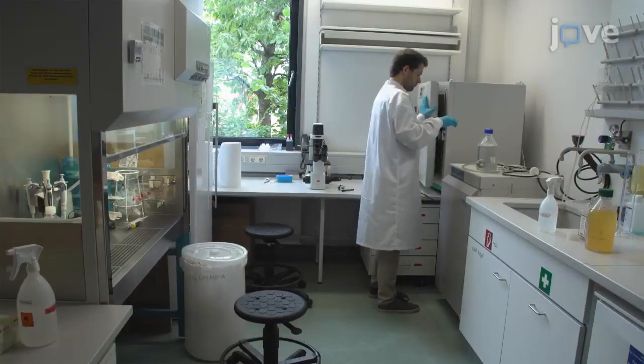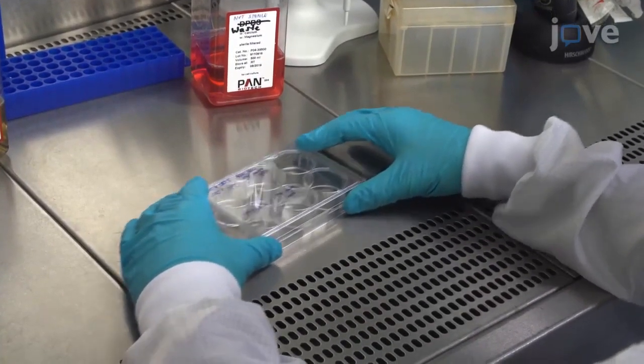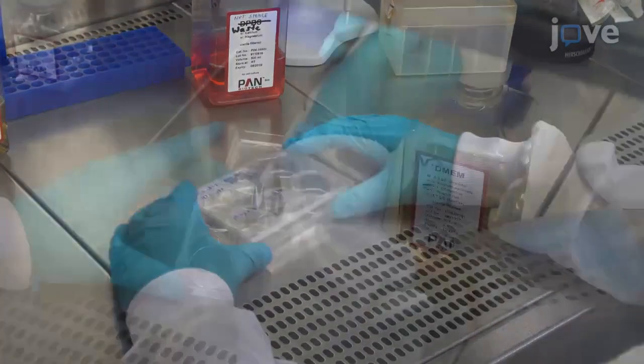Add approximately 50 microliters of EDTA solution dropwise to each well to facilitate detachment of the cells. After incubating at 37 degrees Celsius for 2 minutes, slowly shake the 6-well plate laterally to detach the cells. Next, add 950 microliters of growth medium to each well.